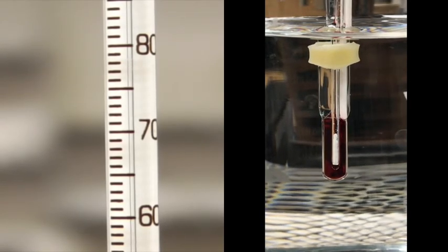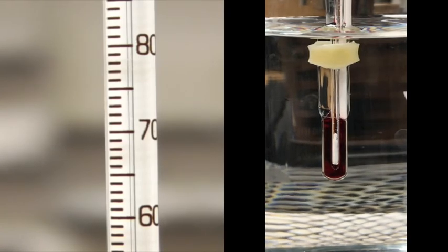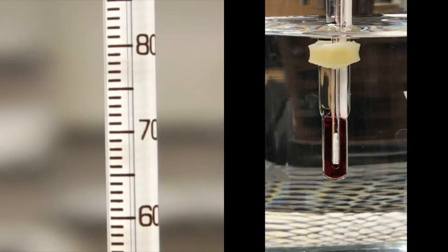Okay, we're moving up about 43 right now. So in a little bit we should be able to see it on our camera on the thermometer. See, it's still all crystalline. Okay, we're getting up a couple degrees below 50, so we're heating up really quickly.